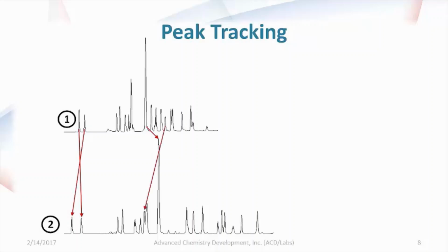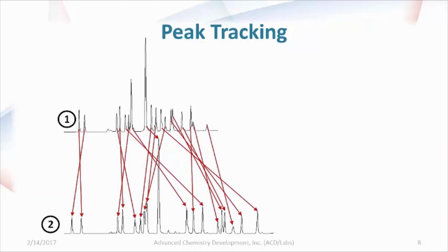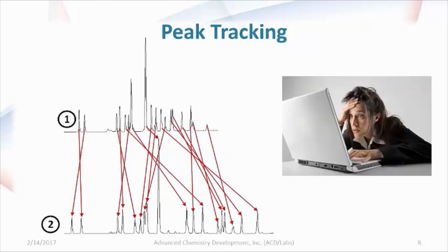But you see, as peaks move around, this can actually become a very tedious and cumbersome project. And what this can do as an analyst is eat up a lot of your time and actually give you a lot of headaches and keep you out of the lab rather than being in the lab working on all the instruments.